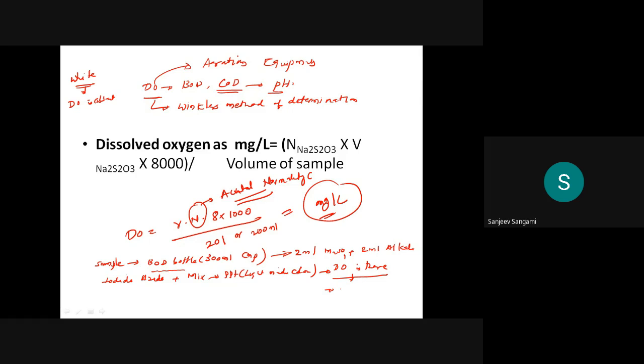Wait for about 10 minutes so that all the precipitate which is formed settles. Once the precipitate is settled, dissolve that precipitate using concentrated H2SO4.